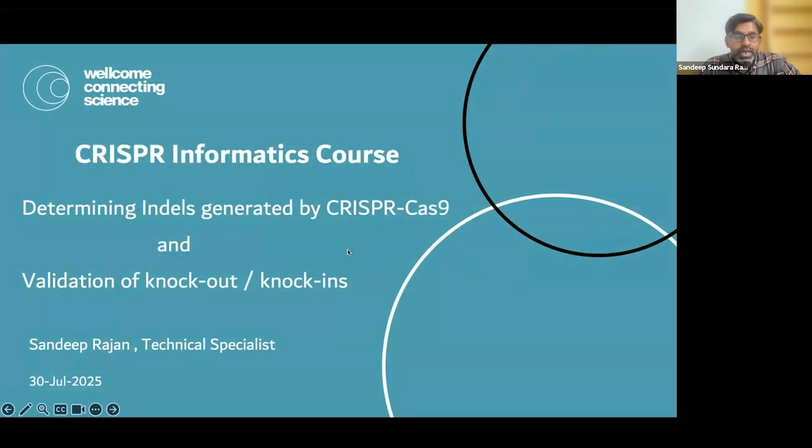As I mentioned before, I'm Sandy. I work as a technical specialist in the cellular operations team. In Sanger, we run huge pipelines to perform large-scale screening or even experiments to generate high-throughput data. When we work in such projects, we always have to find the most reasonable way to achieve high quality data in the most high throughput format. And that's where some of the things that I might talk about come into play.